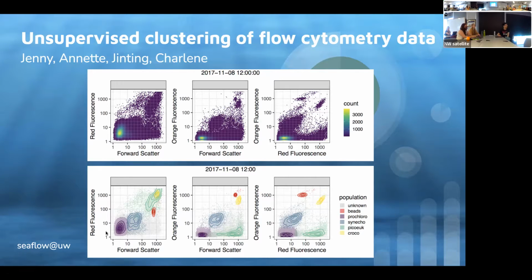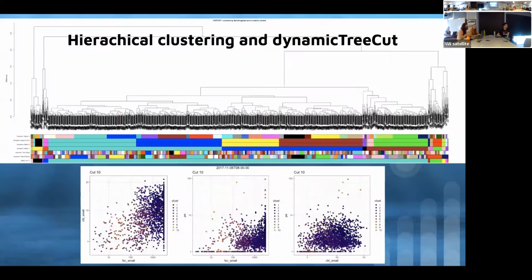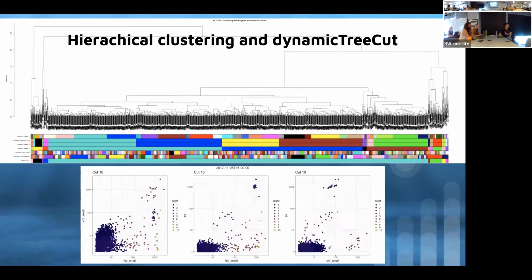This bottom panel was done by me by hand. And the idea is to go hands-free and use machine learning or other types of algorithms. And we kind of threw the kitchen sink at it, where each of us did something a little bit different.